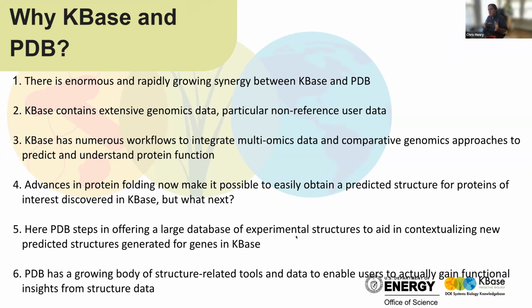But also it provides you an ability to quickly compare your genes and your computational structures in KBase to the experimental data in PDB. And as Stephen just spent a long time explaining, it's very important that the experimental structures offer an enormous amount of information. The computational structures alone, they really don't stand alone. You need those experimental structures too.